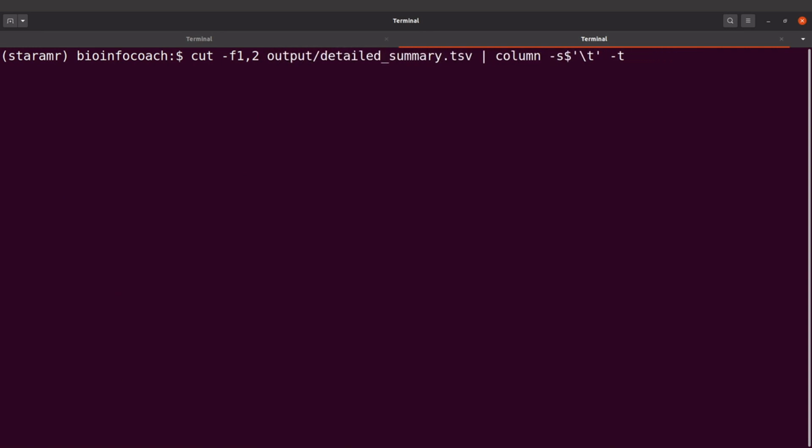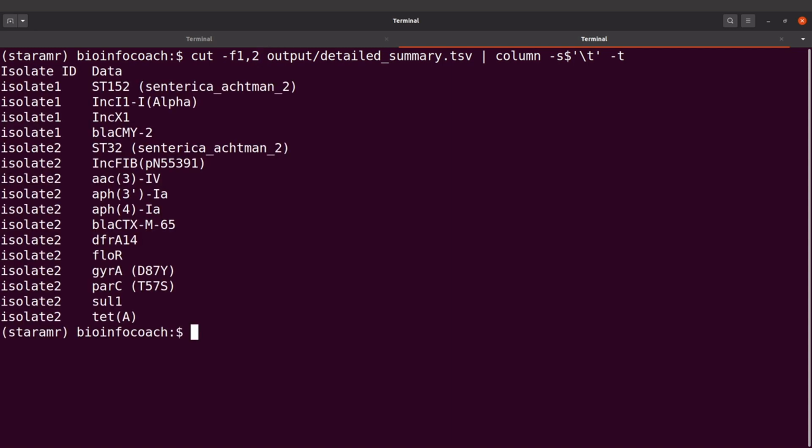Or alternatively you just open it with spreadsheet software. So let's execute this. So we have some information here. So basically everything is here. So just go all out, try your Linux commands to explore. This tutorial is only giving you an intro. Okay, so that's what we have.